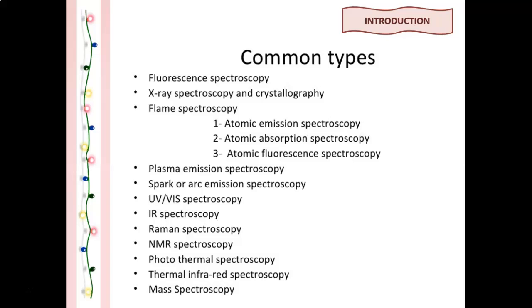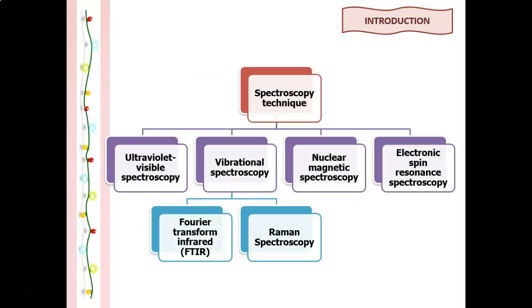Alright, so common types of spectroscopy. We have fluorescent spectroscopy, X-ray, flame spectroscopy, plasma, sparks. We will cover only UV-Vis spectroscopy and infrared spectroscopy in this syllabus, PST 351.